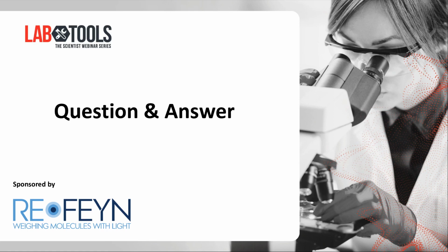Yeah, so that's a good question. For the solution experiments, we have actually used a non-commercial setup, which was slightly more sensitive than the one from Refeyn. It had a blue laser, which generates a stronger scattering signal, basically, and the sensitivity of that setup was higher than for the one from Refeyn. So we could go down to these really small proteins and still detect them. Maybe not quantitatively, but at least we could detect them.